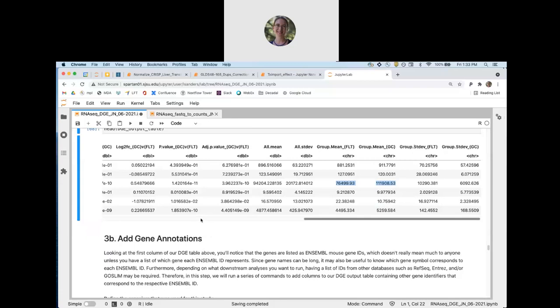Because the one thing about Jupyter Notebooks is that you have to wait for the cell before to finish before you can run and see the output from the subsequent cell.